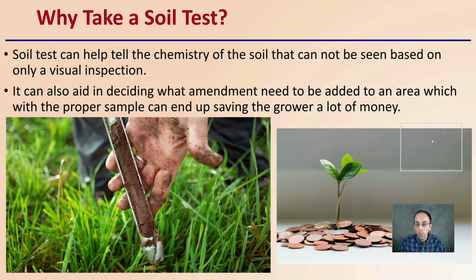All right, here I'm going to go over the steps on how to take a proper soil sample, and then walking you through the process myself as well. Hope you enjoy the video.